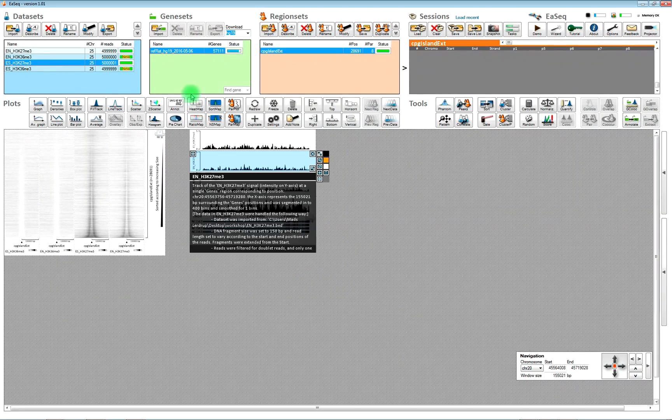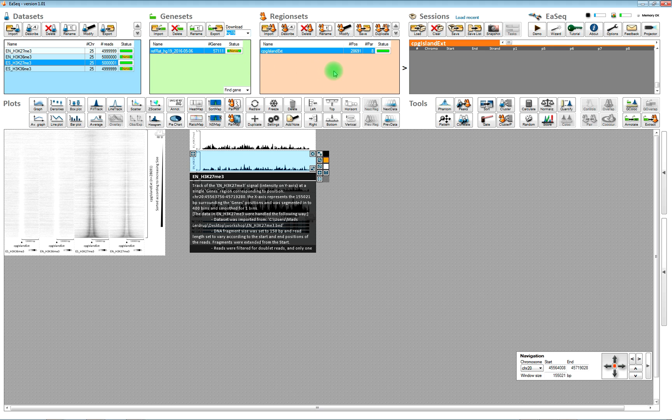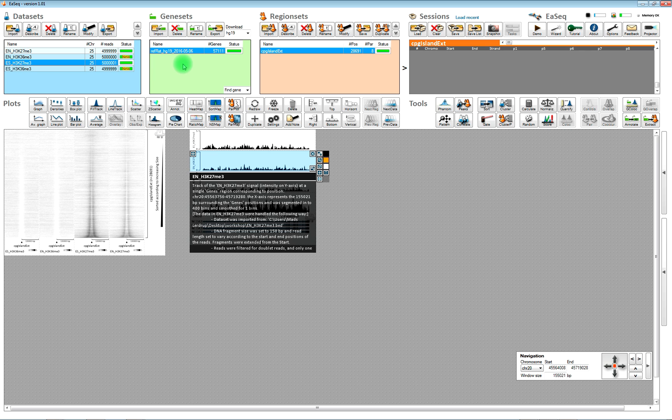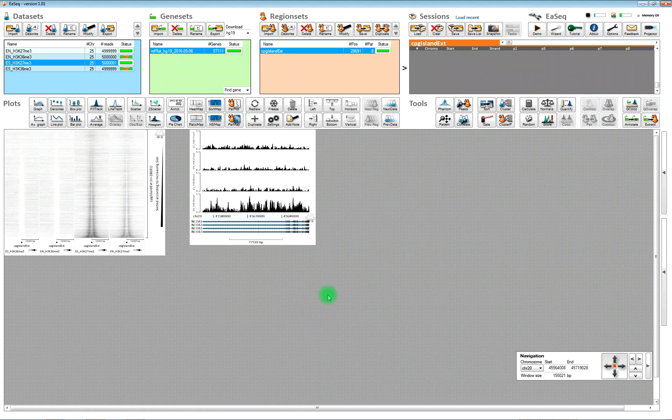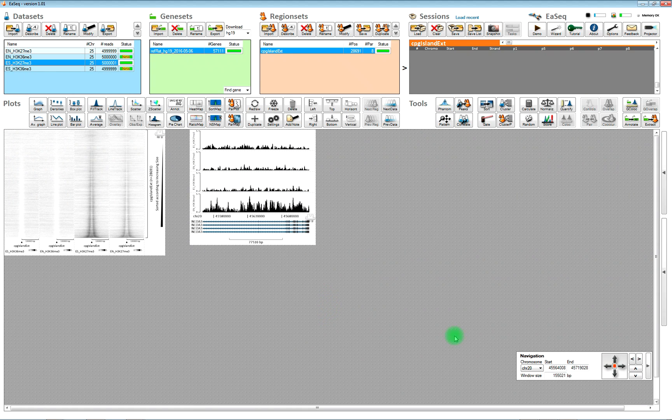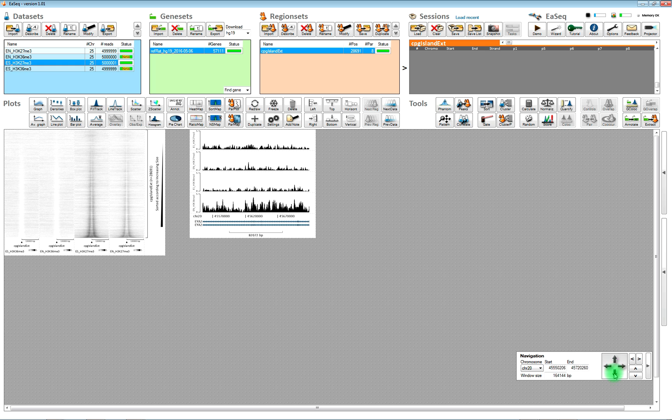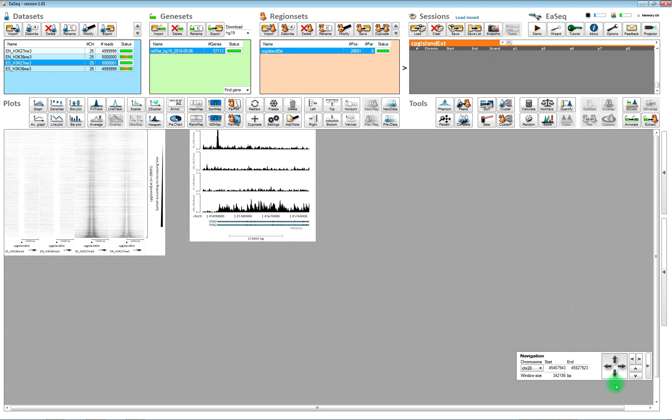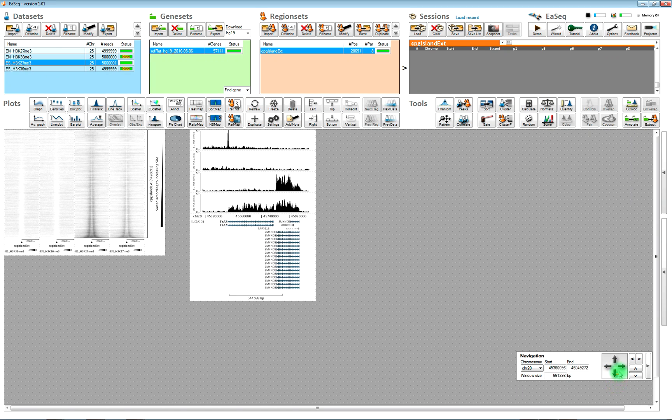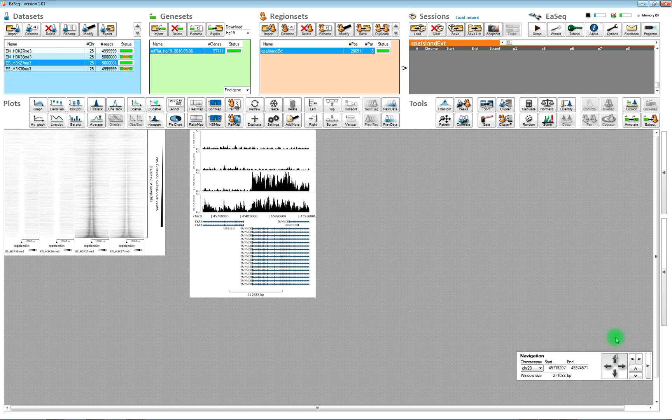Then it will import the genes. And once we have a gene set imported, then we will start to have gene information here in the tracks.